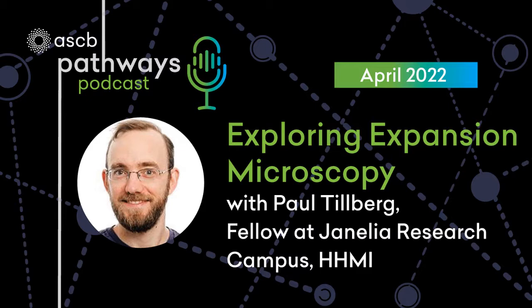And then you also described, there was one paper you sent me that described the EASI-FISH method that seemed to be for thicker tissue samples. Tell me a little bit about that. Yeah, so with EASI-FISH, we started with the ExFISH method, which was spearheaded by Fei Chen in Ed's lab. What that method let you do is basically retain not just protein in the gel, but also retain nucleic acids, particularly RNA molecules.